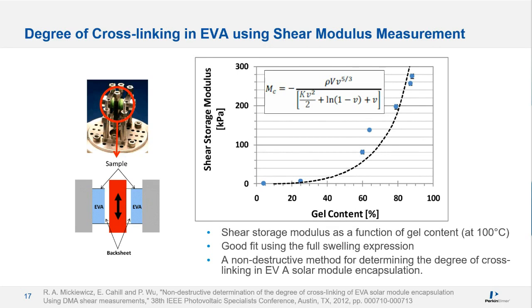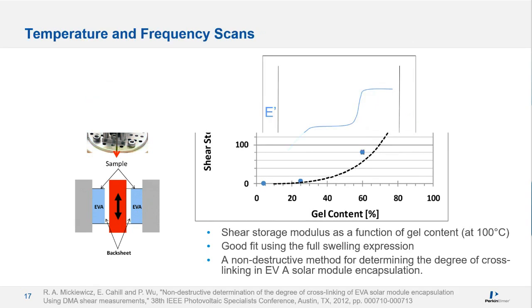It was demonstrated that a very good fit using the full swelling expression allows for determining the degree of cross-linking in EVA solar module encapsulation with this new non-destructive method.